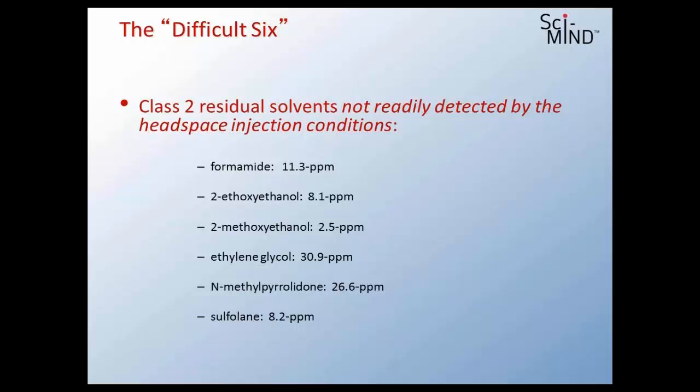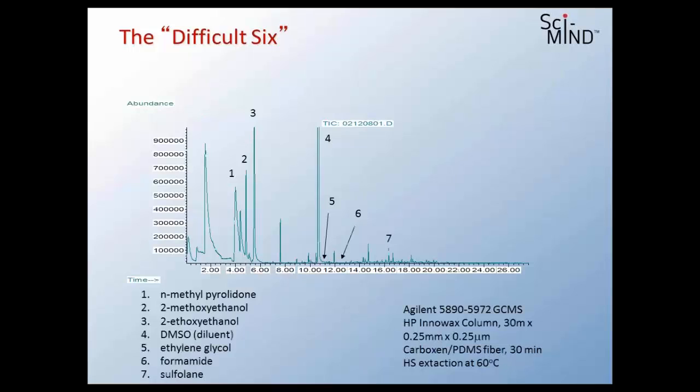Well, this is an example of what we were able to do: take advantage of chemical equilibrium and take advantage of the SPME technique in order to extract these solvents and to run them, because the big problem with these is that they're all high boilers. So they interfere with traditional solvents that are used in the traditional methods for this. Our approach was to use SPME, and it was actually quite simple. We just took one of these SPME fibers and stuck it down into a vial containing these solvents and heated it up.